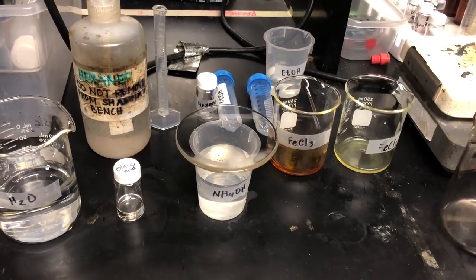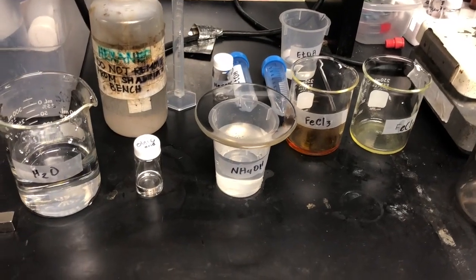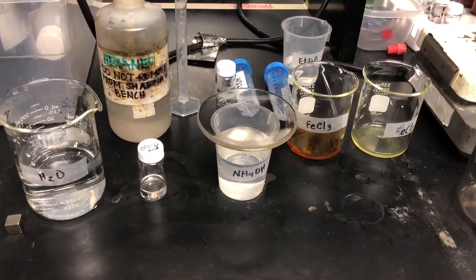Now, we have this set up a little bit different, and we're going to be doing this a little bit faster than normal, but all of the procedures are roughly the same, so please make sure you use this to your aid, but don't follow it exactly. Follow the procedures as written.